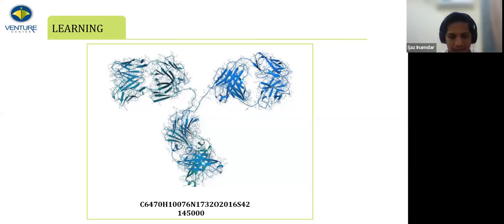In some presentations, you might have seen that people talk about small molecules when they explain the principle of mass spec or basic data analysis. Here I've purposely taken a slightly complicated molecule so I get to tell you more about the high-end mass spec that we use. What is the need to use a high resolution mass spec, or a mass spec that has a very high scanning speed? That is the purpose of taking a slightly complicated molecule.